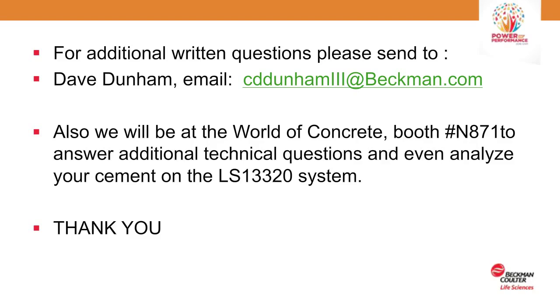Well, I'm sorry, I see some more questions coming in, and since we have some more time, let's go through them. So another person asked, how does the auto rinse work?